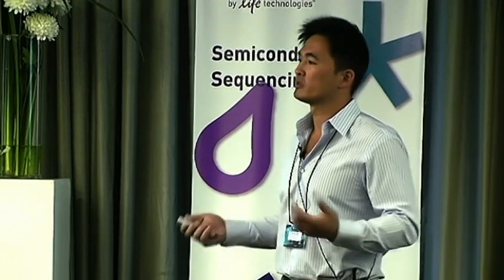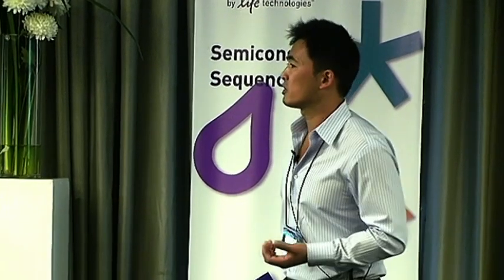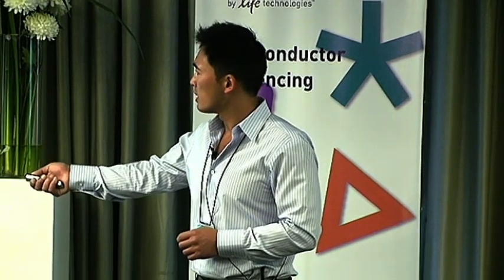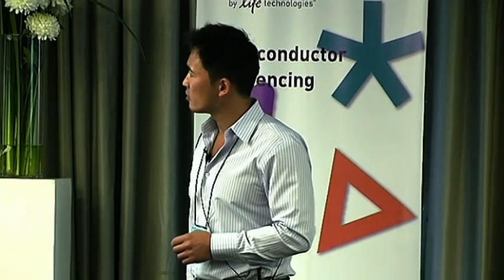What if they want to look at hundreds of markers or potentially even thousands of markers, and they want to use qPCR? There's always been this huge gap in this area here. What you're seeing on the y-axis is basically the marker content. How many genes or how many features are you looking at?